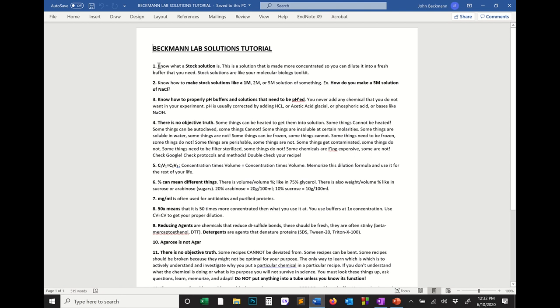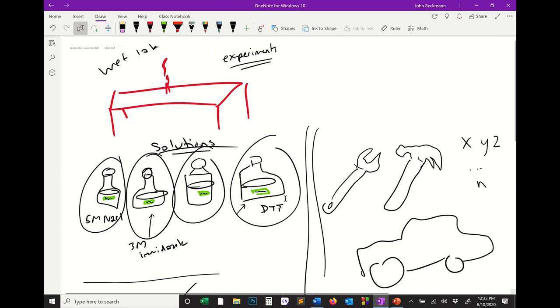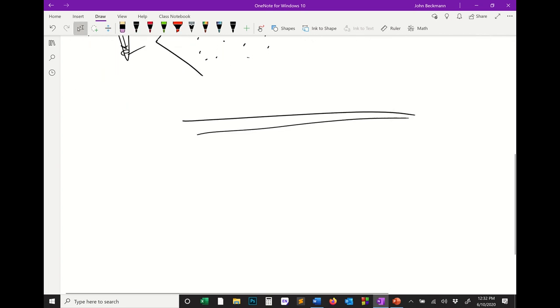Okay, so the first point here on my introduction to the basics of setting up your first toolkit in a wet lab, you need to know what a stock solution is. So let me describe a stock solution. These things are solutions, but in the lab, the solutions get a little bit more complicated.